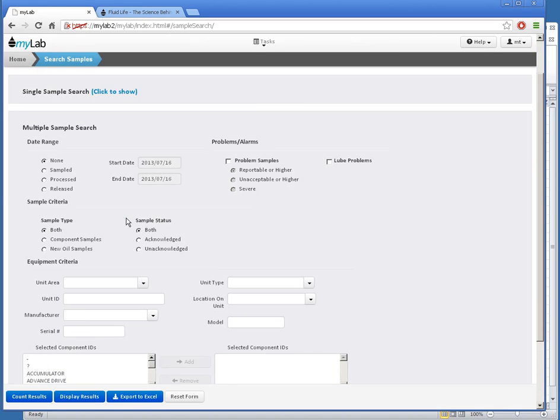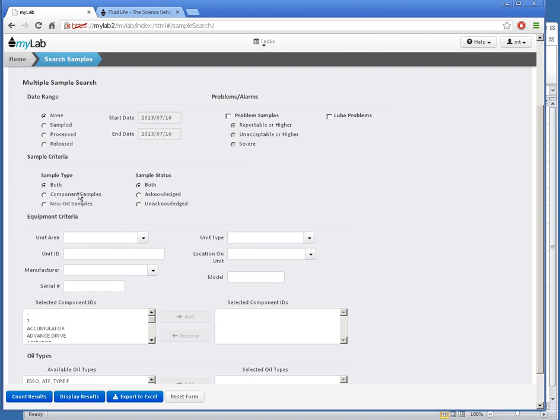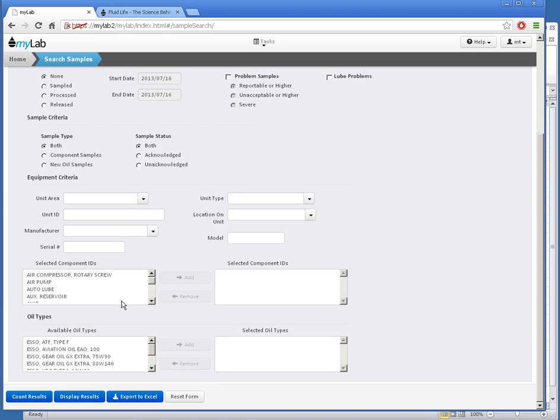And now I have many options to filter and define my search. I can pick several different date ranges here. I can choose only problem samples and severity here. I can limit the results to equipment or new oil samples, acknowledged or not. And I can filter by equipment information here and the kind of oil used here.